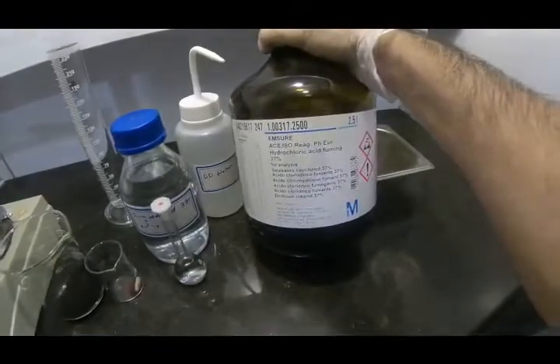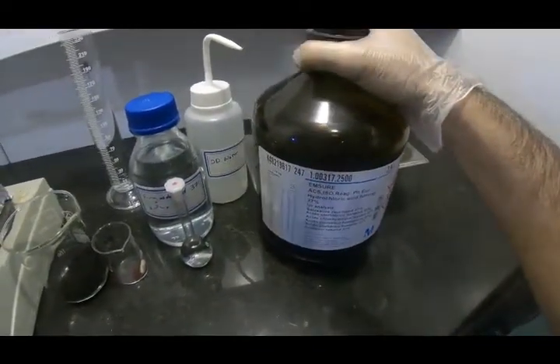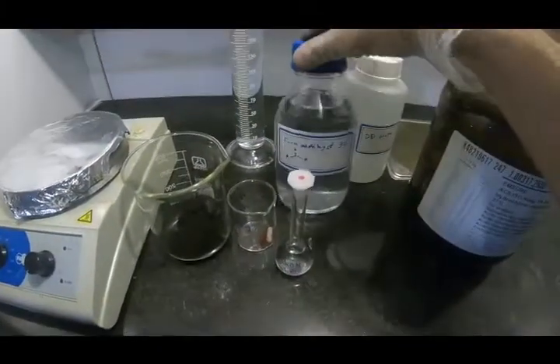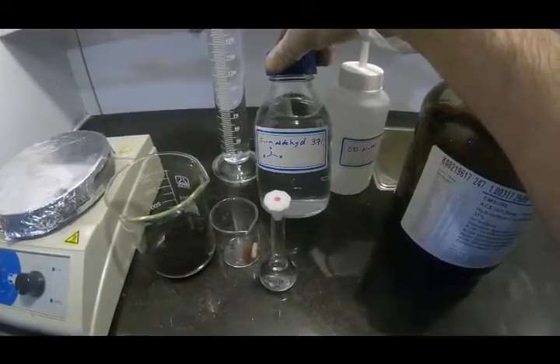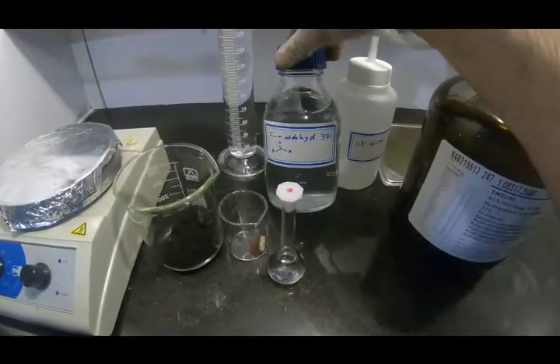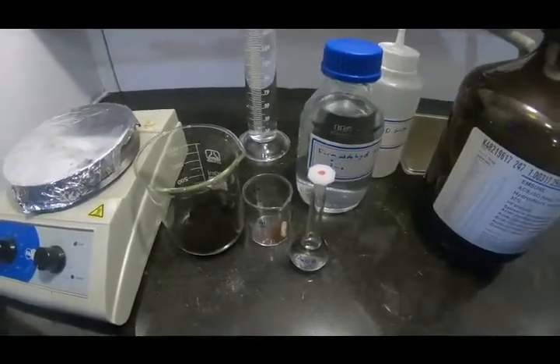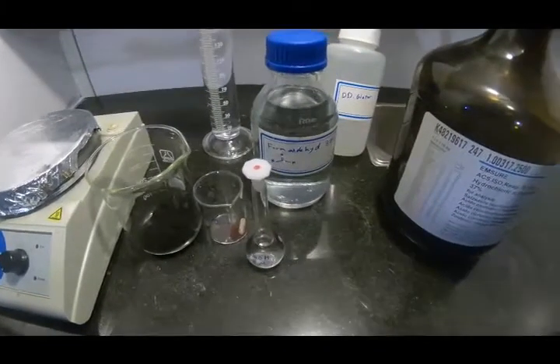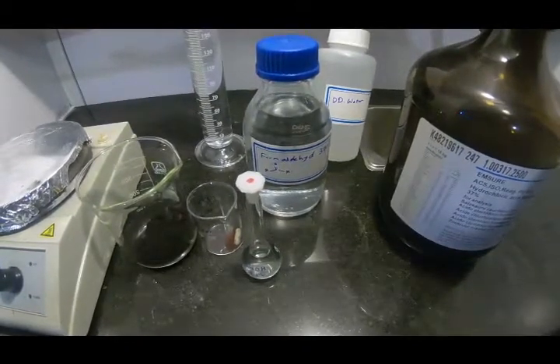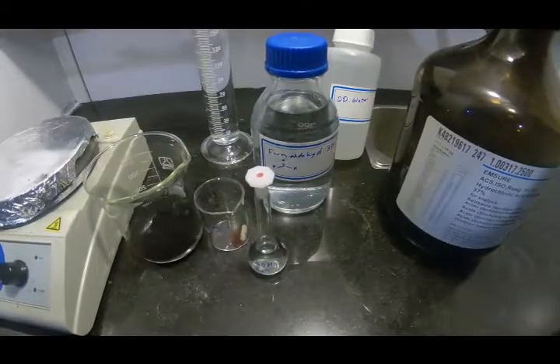You need concentrated hydrochloric acid in order to dissolve palladium chloride. You need formaldehyde, 37% in order to reduce palladium. And you need double distilled water or deionized water, whichever you can access is going to work just nice.